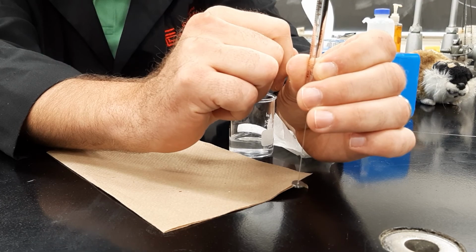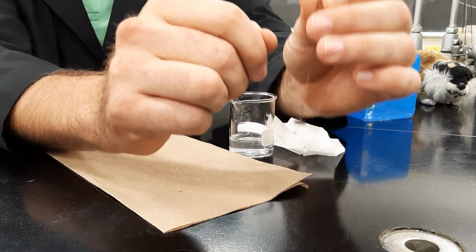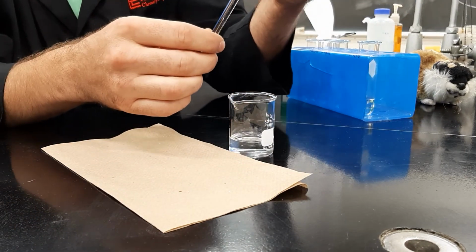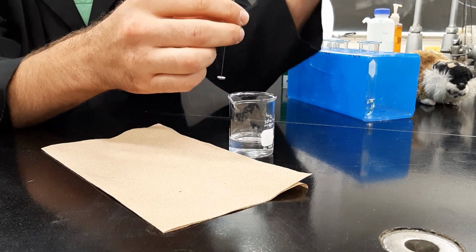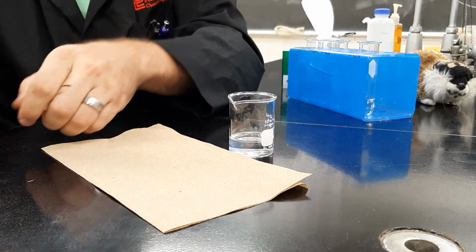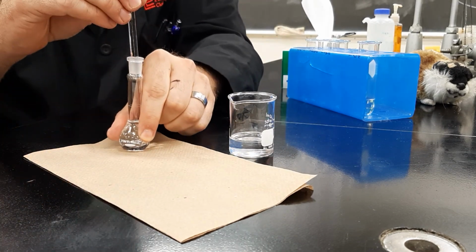There it goes. And then I always make the measurement upside down and dispense it into a chem wipe that can then be discarded. That's it.